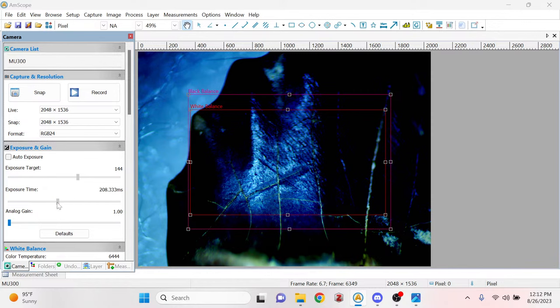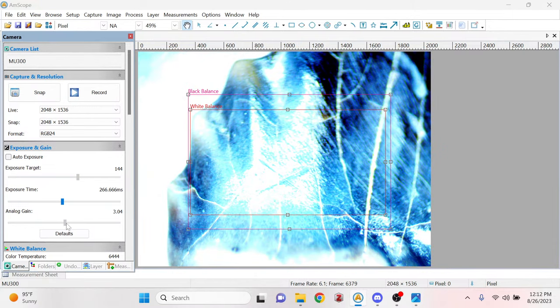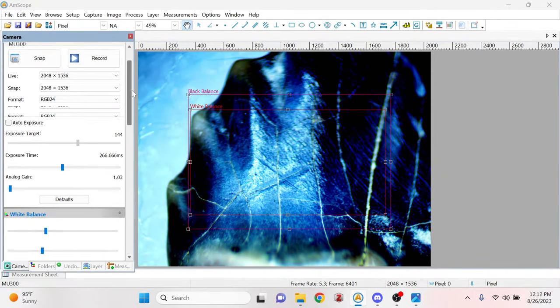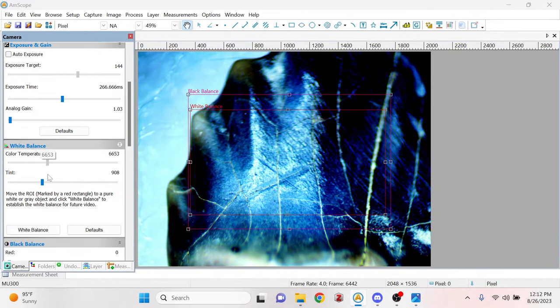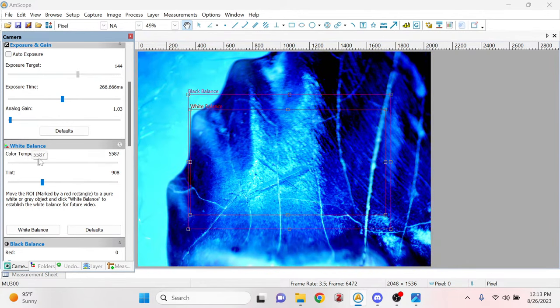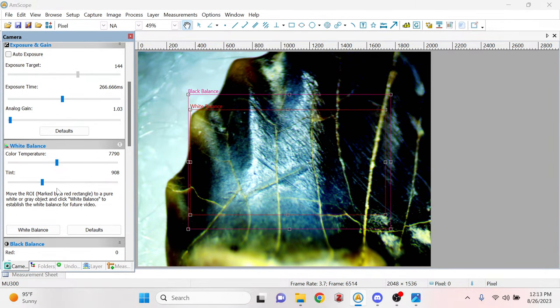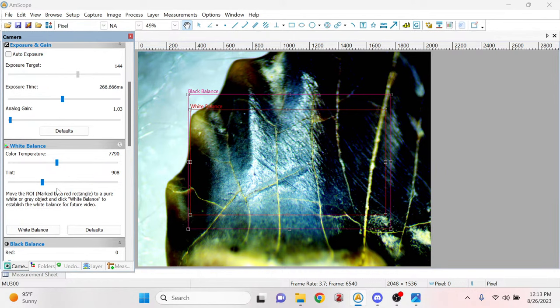I can mess with various settings on here to change how the image looks. So yeah, today I'm just kind of messing around, getting myself reacquainted with this. Ooh, I like that contrast. Although I am a fan of blue, if you couldn't tell. It's making everything blue. I really like messing with the color temperature on this thing, because it makes all this kind of abstract art looking stuff. Let's see. When you get up this close, it can be hard to get a large area in focus. That's really cool.